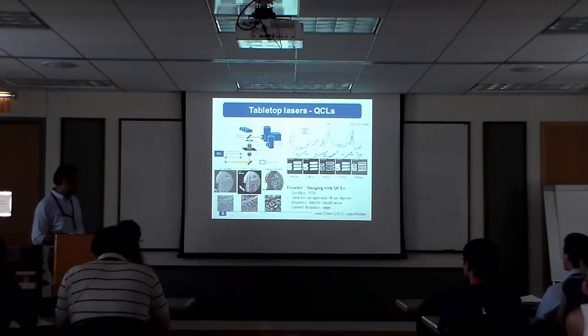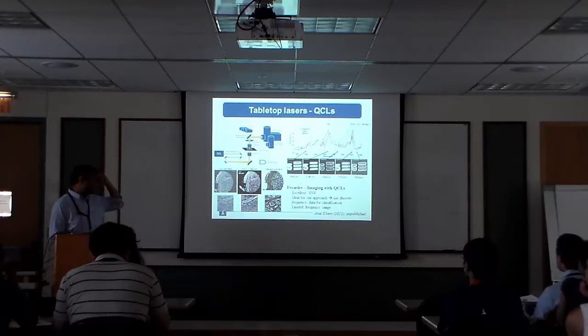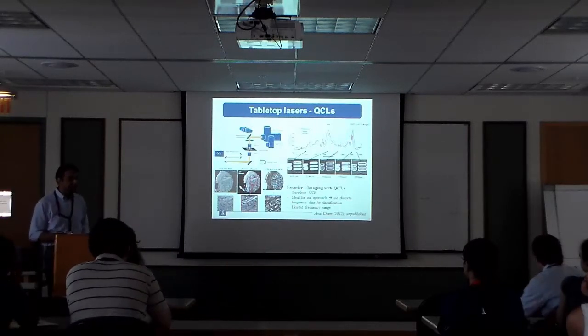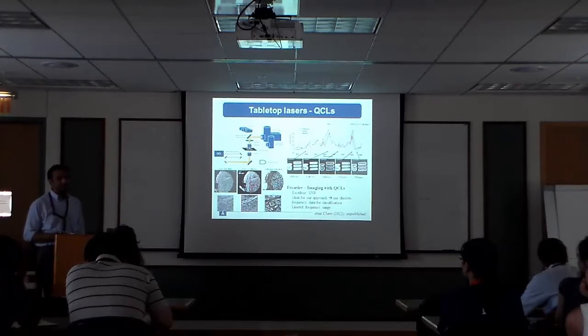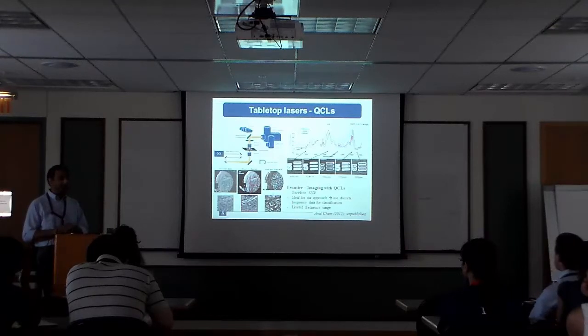The way we've done this, we worked with a company in San Diego for about 4 or 5 years. We got the first quantum cascade lasers from them, and these are narrow bandwidth, single frequency lasers that we can use that are very, very high intensity, 1,000 times brighter than the heated wire source, okay? So we can use these in intelligent ways, and there are some issues that come along with using lasers, but we're trying to resolve those.